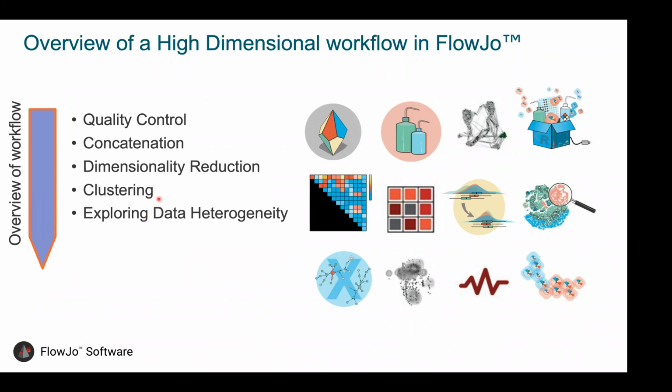So all those functions, of course, you can perform in FlowJo v10, with the use of plugins. Some of those functions are specific to plugins. Some are already built in, for example, merging samples together. Also, tSNE as a dimensionality reduction is already built in FlowJo, but some others are only available as plugins into FlowJo.